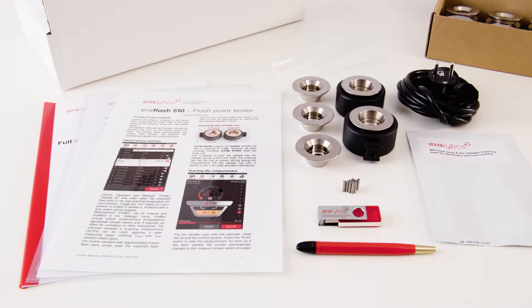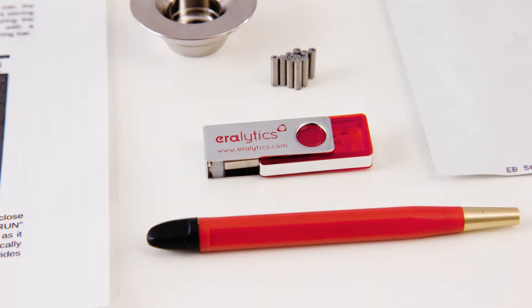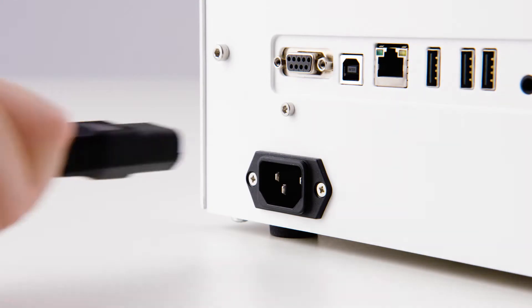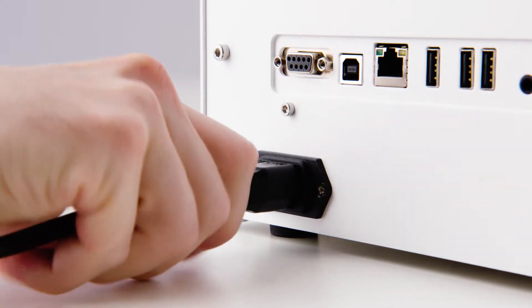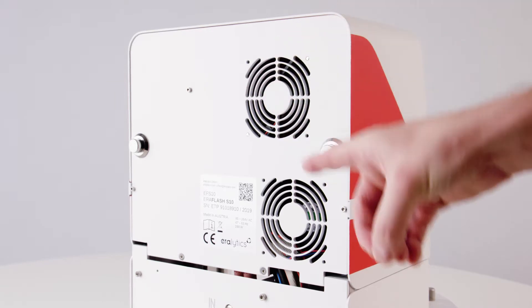instrument-specific items, the printed short manual, and the USB drive containing the full user manual. Plug in the power cable on the rear side of the instrument. Make sure that the vent holes are not obstructed.